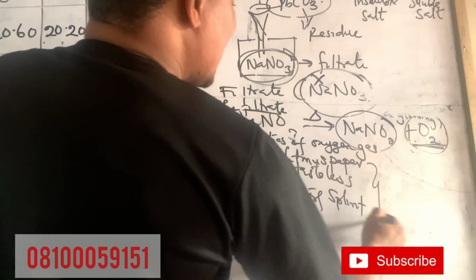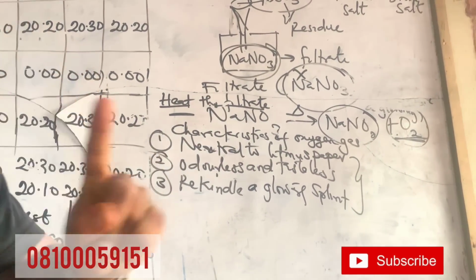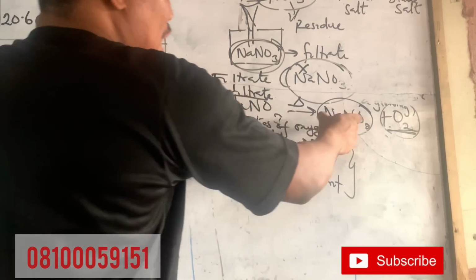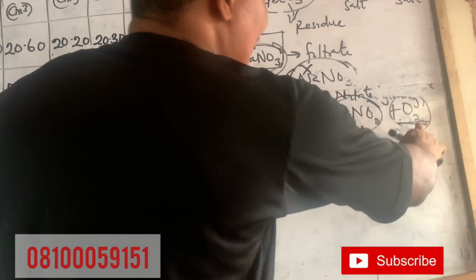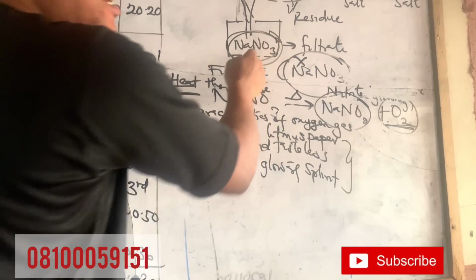So that is if they ask us to heat the filtrate. Please note this and take note of this. If you are asked to heat the filtrate, then we have sodium nitrite, not nitrate, nitrite, and oxygen gas. So that's one of the tests I'm expecting from the filtrate.